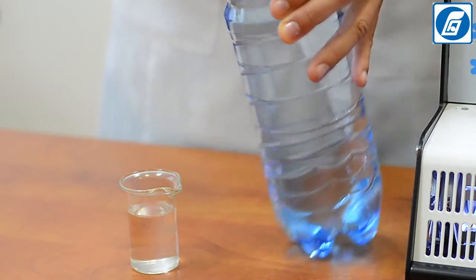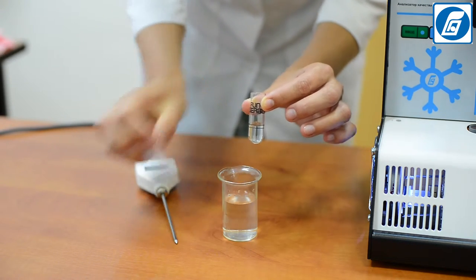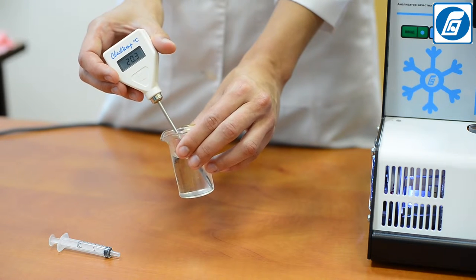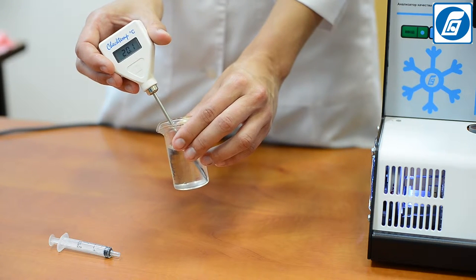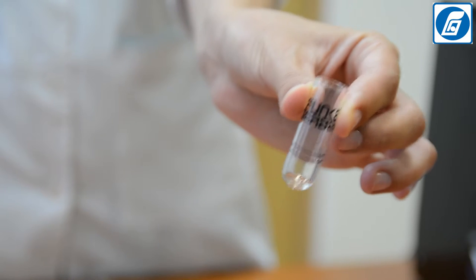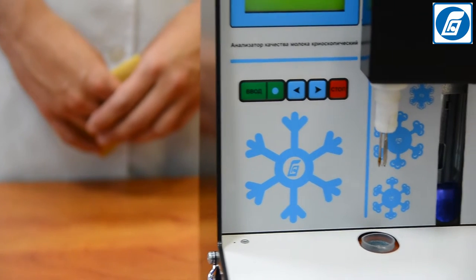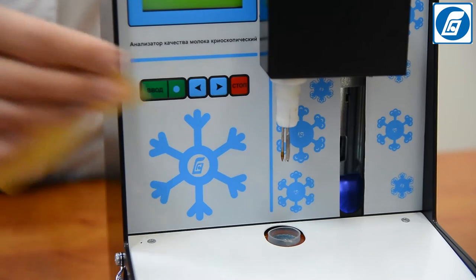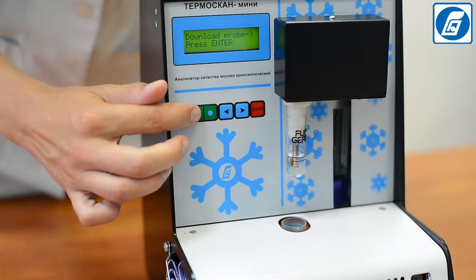To check calibration, pour 2.5 cm³ of standard solution into a dry, clean test tube. The solution temperature should be 20 ±2°C — control this with a thermometer. Test tubes must be free from cracks and scratches on both inner and outer sides, otherwise results may be incorrect or crystallization may not occur. Ensure the probe and hushing wire are clean and dry; if necessary, wipe them with a soft, clean, non-fibrous tissue.